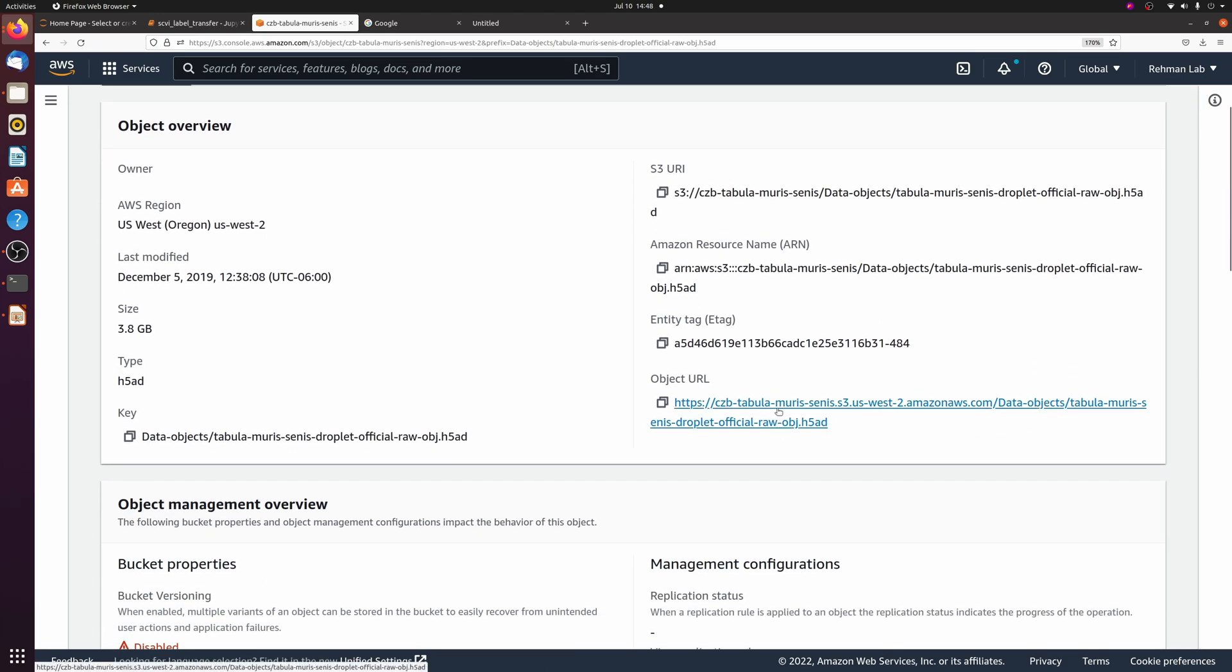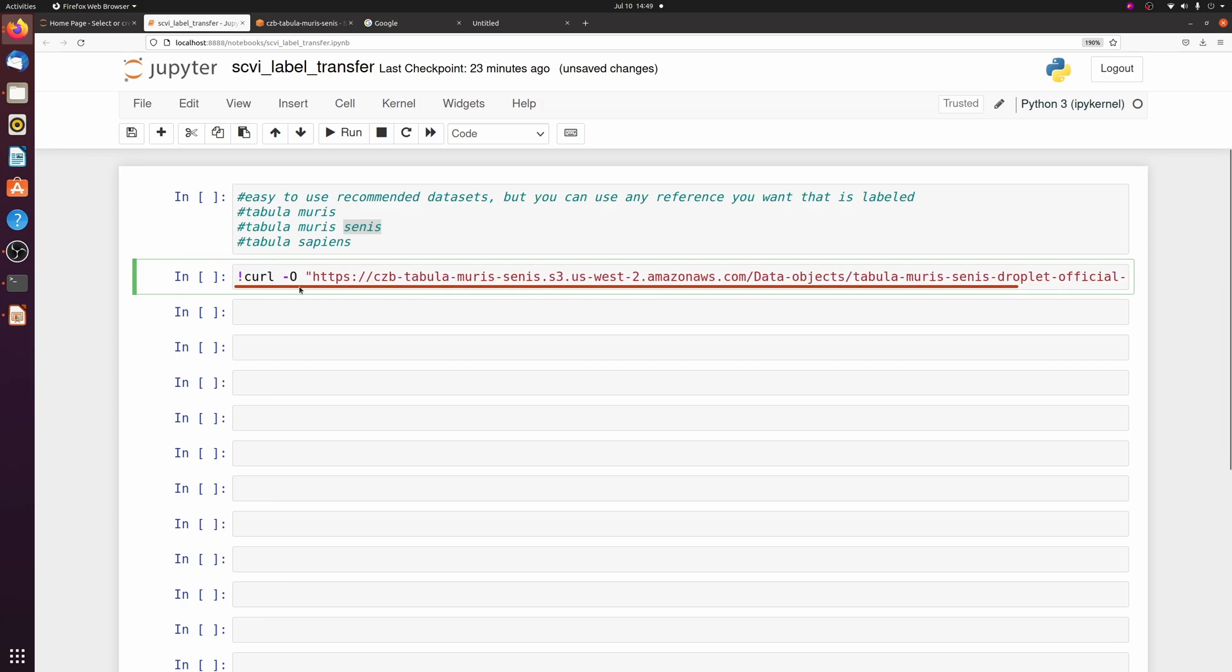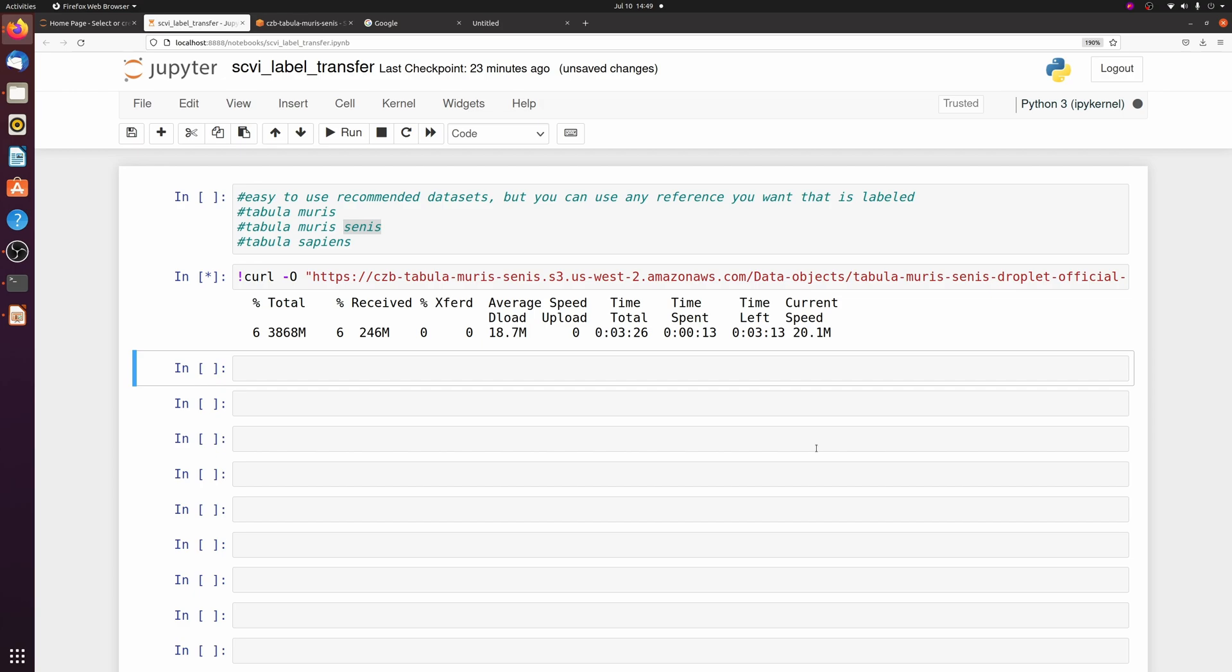I'm just going to download the official raw dataset, so you can go here and you can just copy the link and then we're just going to curl that. I'll keep this in my Jupyter notebook that I upload so you don't actually have to go find it yourself. This should take a couple minutes to download, but after you download it the first time you won't need to download it again.